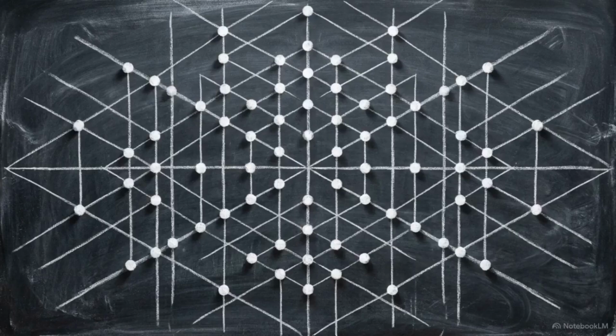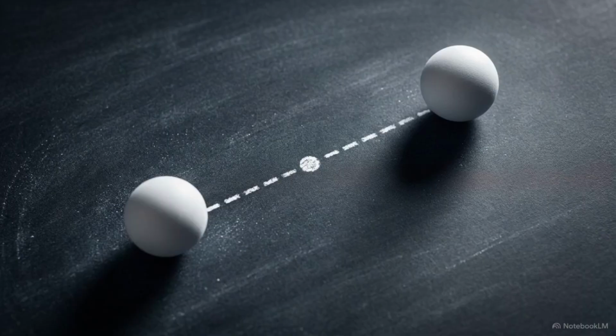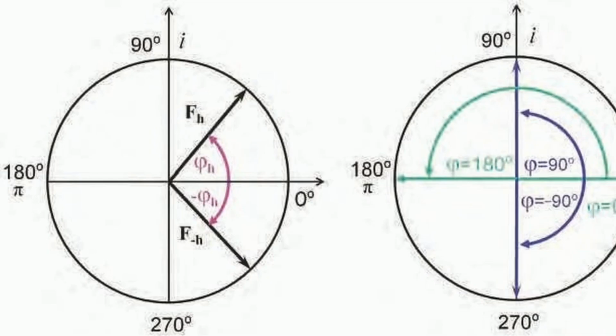Because the phase data is missing, the map of reciprocal space appears as a perfectly mirrored symmetrical geometry. This symmetry is codified as Friedel's law. It states that in standard X-ray scattering, reflections on opposite sides of the origin will always display identical intensities. We map a standard Friedel pair on the complex plane. Reflection HKL and its inverse share equal amplitudes and conjugate phase angles, but detectors only see amplitude. With phases hidden, these identical intensities are the only measurements we collect.